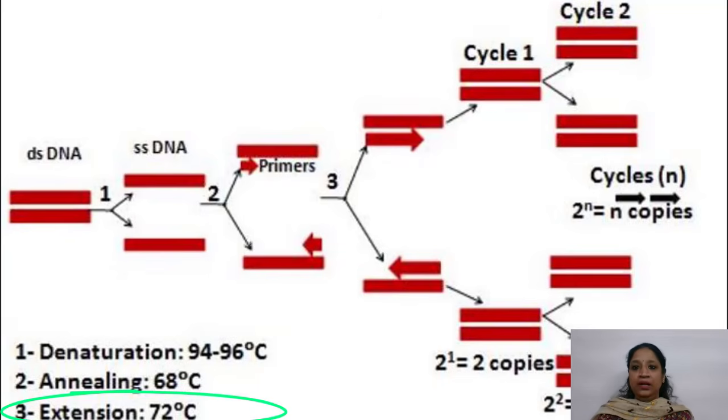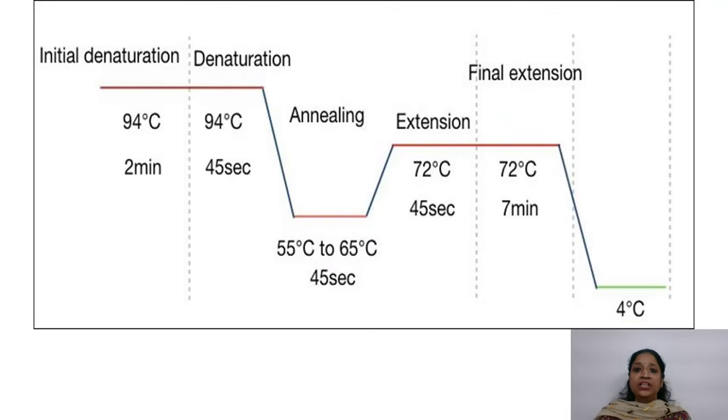1 to 10 minutes. This ensures that any incomplete DNA strands are fully synthesized. Finally, the reaction is held at 4 degrees Celsius to stabilize the amplified DNA product for storage or further analysis.